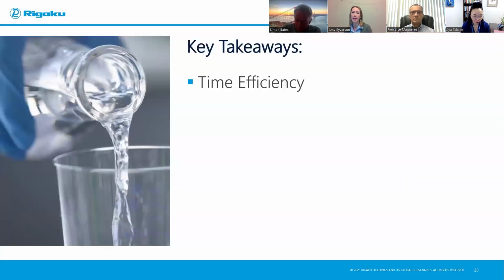So some of the key takeaways, lab work can be very time sensitive. So rushing to meet deadlines, especially when running multiple experiments, often results in making mistakes or creating maybe some chaotic conditions. Having those stock solutions available on hand will allow you to quickly follow up on any results that you may get. In labs where maybe there's multiple experiments running on a daily basis, time is crucial. So having those stock solutions available ahead of time, you can focus more on the core activities of your experiment instead of stock solution preparation.